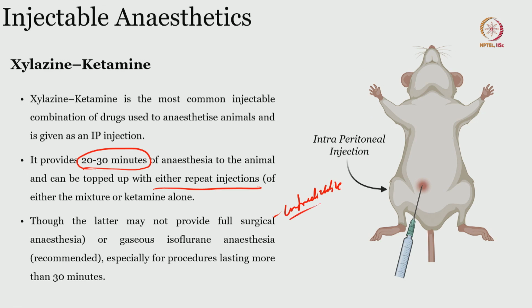That is one of the most important aspects, where it is unpredictable and it can have effects on the vital parameters, which are also unpredictable, alright. It can suppress the heart rate and bring down the blood pressure, and it can raise the intracranial pressure. These are some of the side effects, and the major difficulty is that if the rat is fixed to the stereotactic apparatus, finding a site to repeat the dosages is a big hassle and a really cumbersome procedure to repeat again and again. And those effects will vary from one injection to another. Okay.